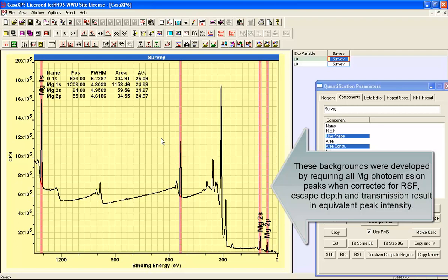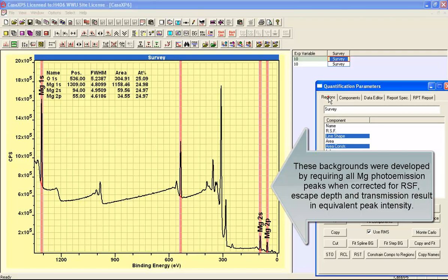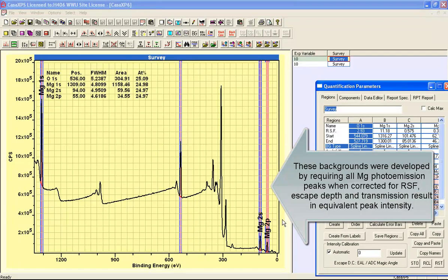So taken as a whole, this would suggest that we do have corrections that are appropriate for these data, that the transmission function is within reason, the effective attenuation length is also within reason, and the Schofield cross sections return values that make sense in terms of the material itself.